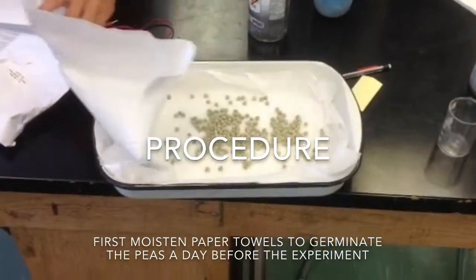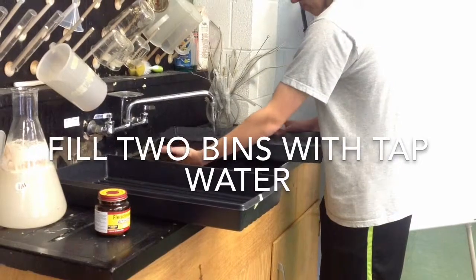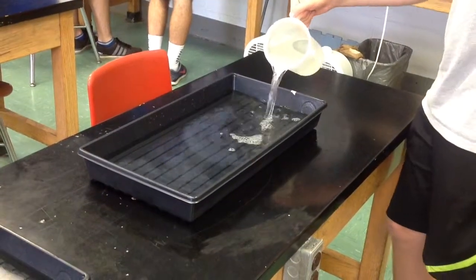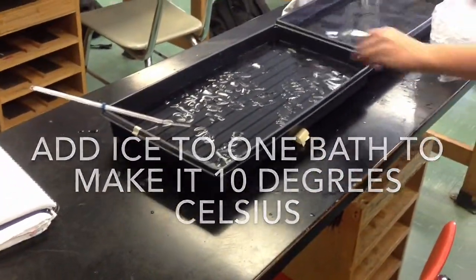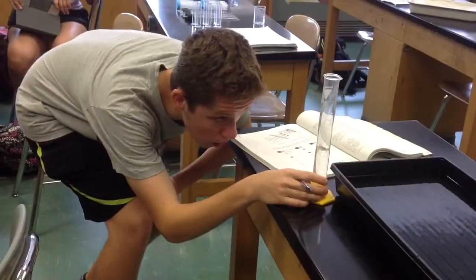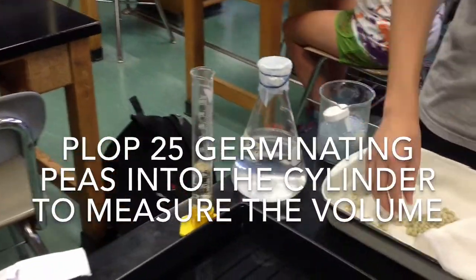Procedure. First, moisten paper towels to germinate the peas a day before the experiment. Second, fill 2 bins with tap water. Third, add ice to 1 bath to make it 10 degrees Celsius. Fourth, measure 50 milliliters of water into a 100 milliliter graduated cylinder. Fifth, plop 25 germinating peas into the cylinder to measure the volume.